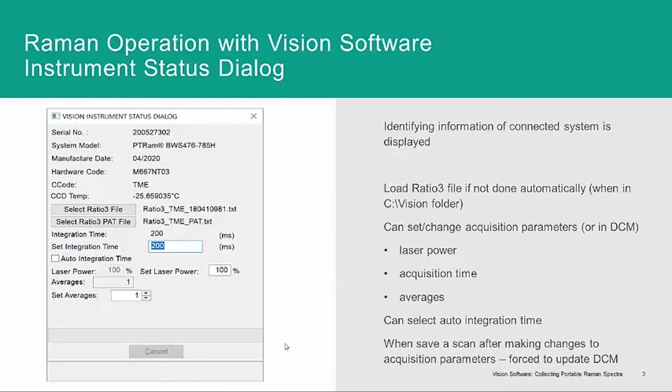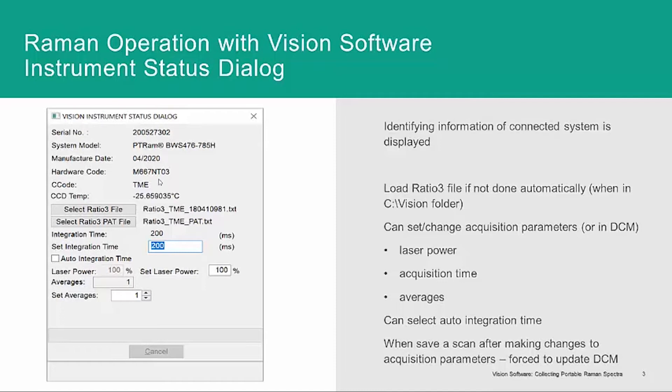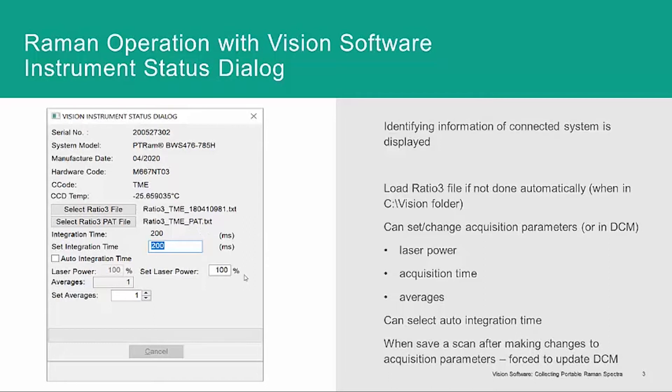When you first connect your iRaman series instrument with the VISION software, an instrument status dialog such as this will be displayed. At the top, it carries the identifying information of the instrument, including its unique three-letter C code, the internal detector temperature, it displays the relative intensity correction or ratio 3 files for the specific instrument connected, and has the information on data acquisition parameters, which can be changed here or in the data collection method, the DCM.